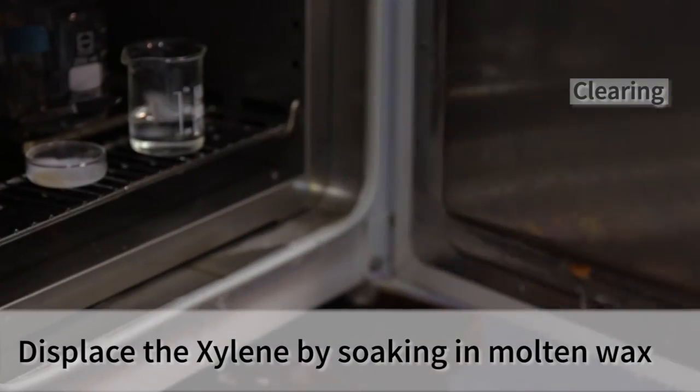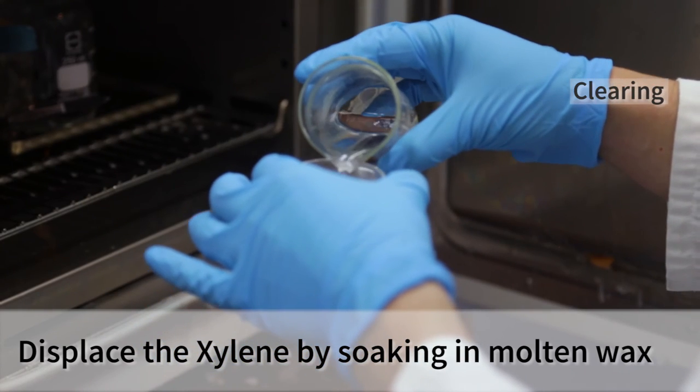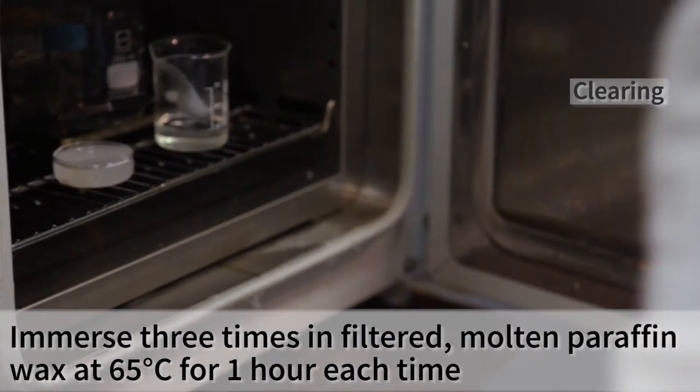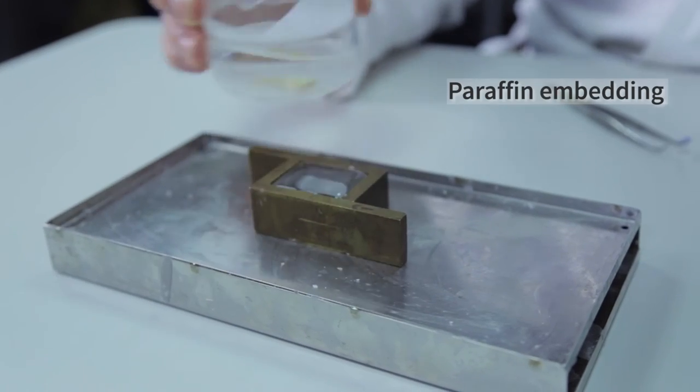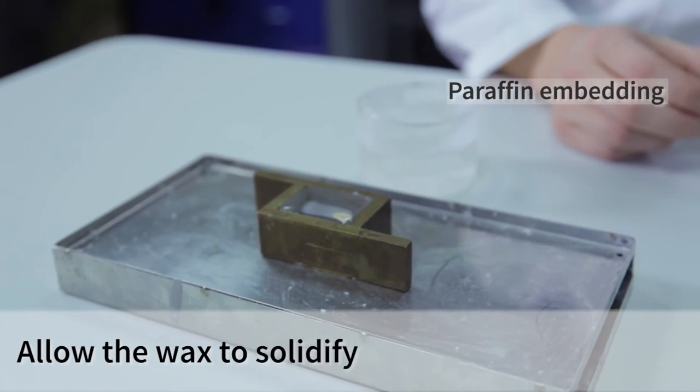The xylene needs to be replaced with paraffin, which infiltrates the tissue. This is typically achieved by immersing the tissue in filtered molten wax three times for one hour each at 65 degrees. The tissue is finally put into a mold and molten wax is added to fill the mold and allow to solidify.